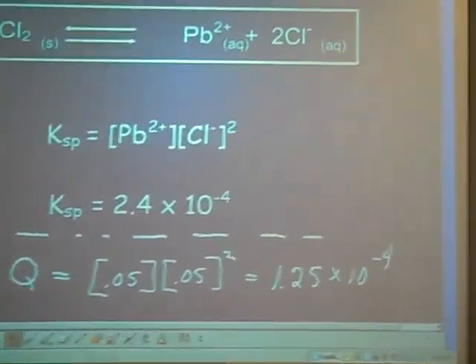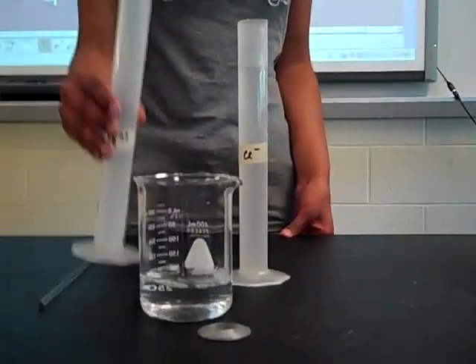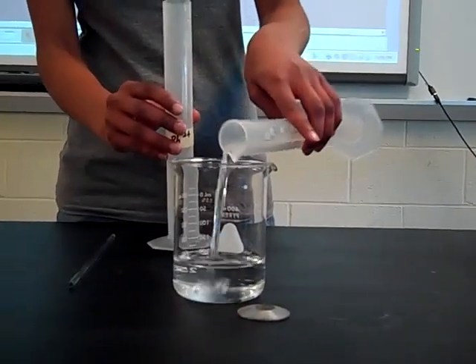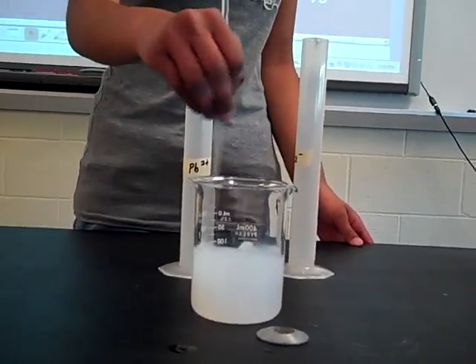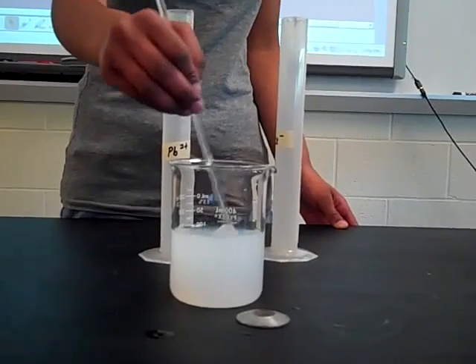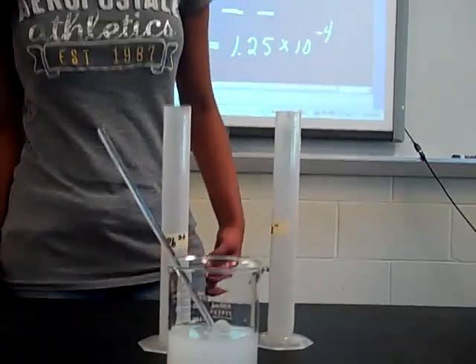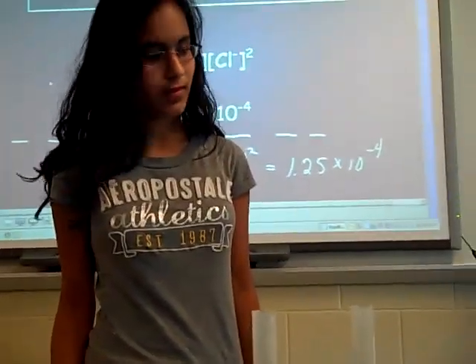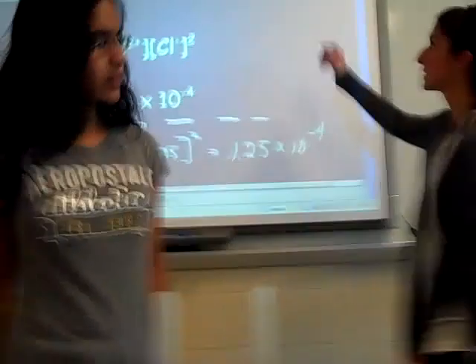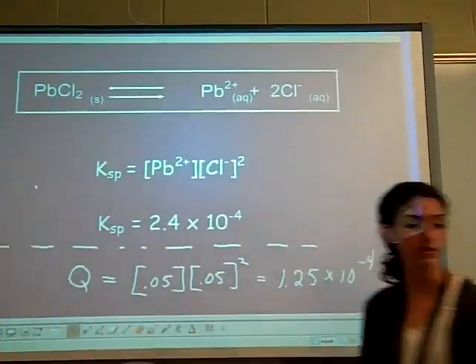Now let's increase this concentration to 0.1 molar with these two. Now, when we mix the two solutions, we do see a precipitate. That is because the product quotient is 1 times 10 to the negative third, which is greater than our KSP. Notice the precipitate. We exceed the concentration of ions needed to make a saturated solution. The excess precipitates out as the reaction shifts towards the left, which we can see from our double arrows.